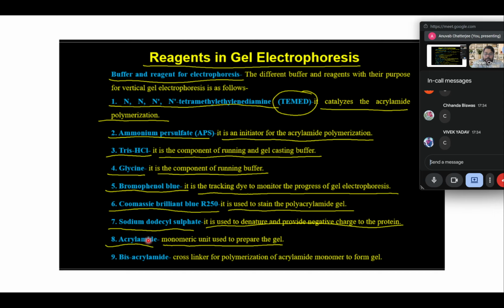So if you want to make an acrylamide gel, you mix acrylamide, you mix APS, and then you can put it aside for a bit. When you are absolutely ready to make the gel, you add TEMED to the mix. What TEMED does is immediately start solidifying the entire structure, because acrylamide will now start cross-linking and forming the gel-like structure. So these three together are used to make the gel.